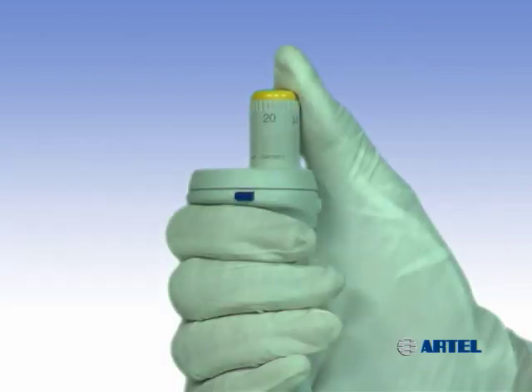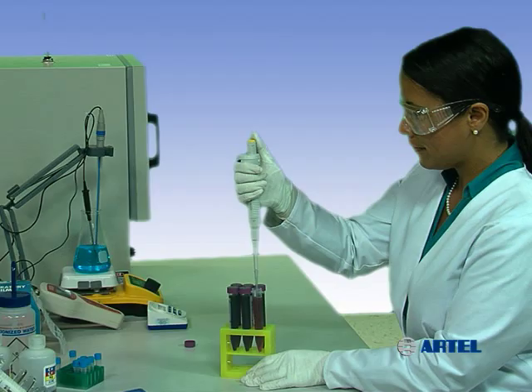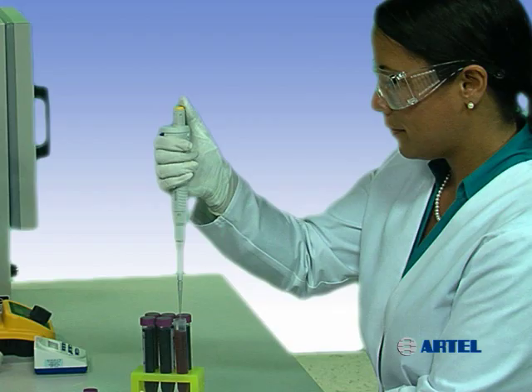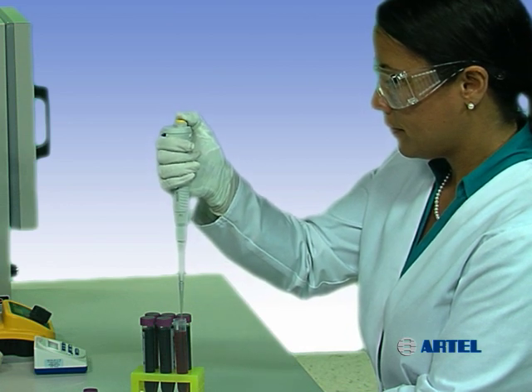Here is an example of pre-wetting a pipet tip. Depress the plunger of the pipet to the first stop. Immerse the tip into the sample and release the plunger to aspirate. Remove the pipet from the sample and dispense the entire contents of the tip back into the sample container or to waste. Using the same tip, aspirate and dispense in this manner at least three times to properly pre-wet the tip.